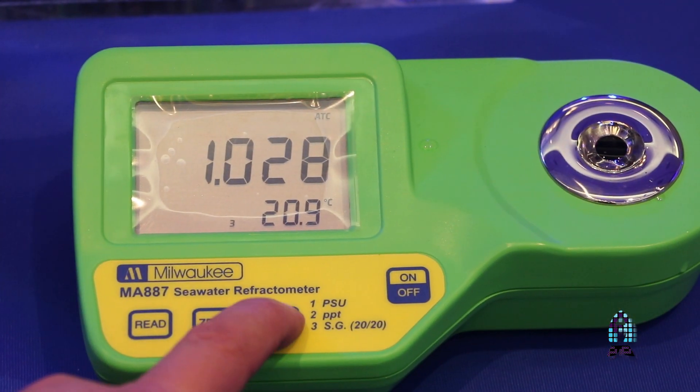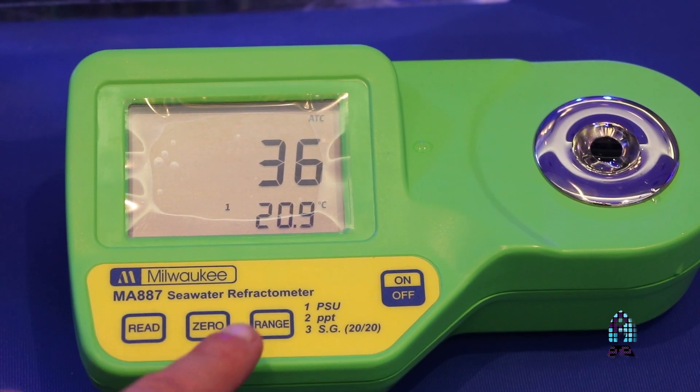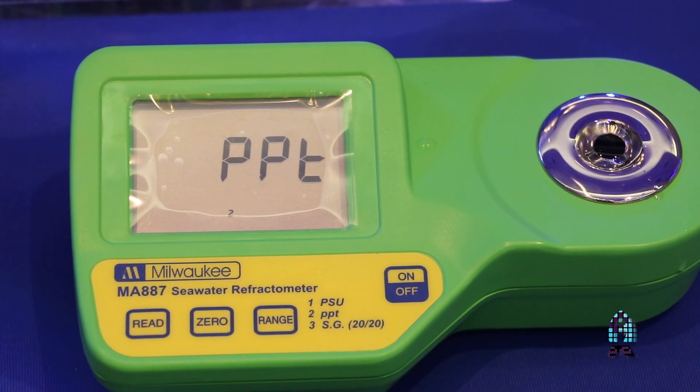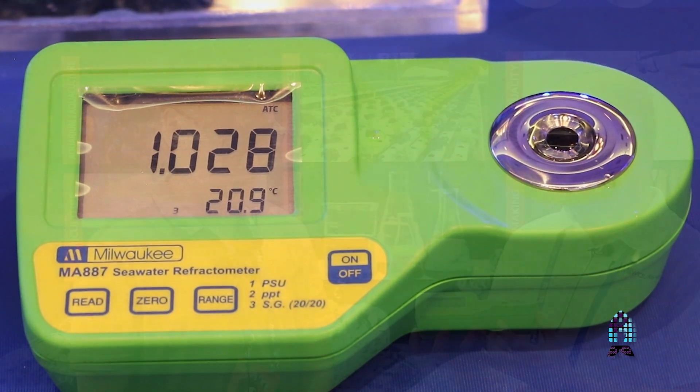Does it only give you specific gravity, or does it also give you more? It can give you PSU and PPT as well. Gotcha, because parts per thousand — I usually go with that because I like the accuracy of parts per thousand. It's funny because I've actually used this for close to about five or six years, and what I really like about this is that it reads the temperature of the water and adjusts accordingly. It does include automatic temperature compensation as well.